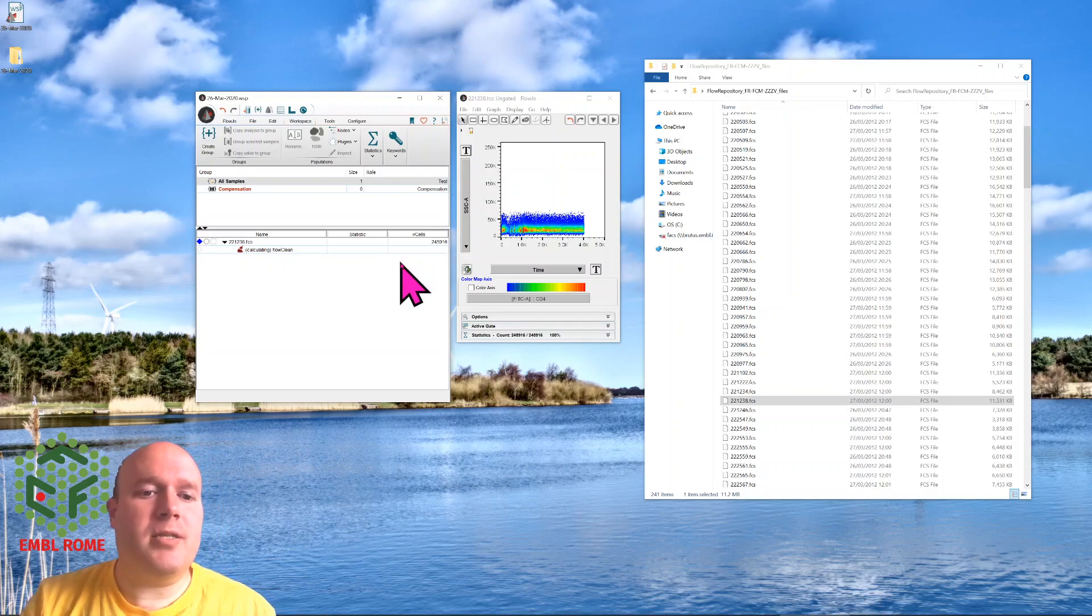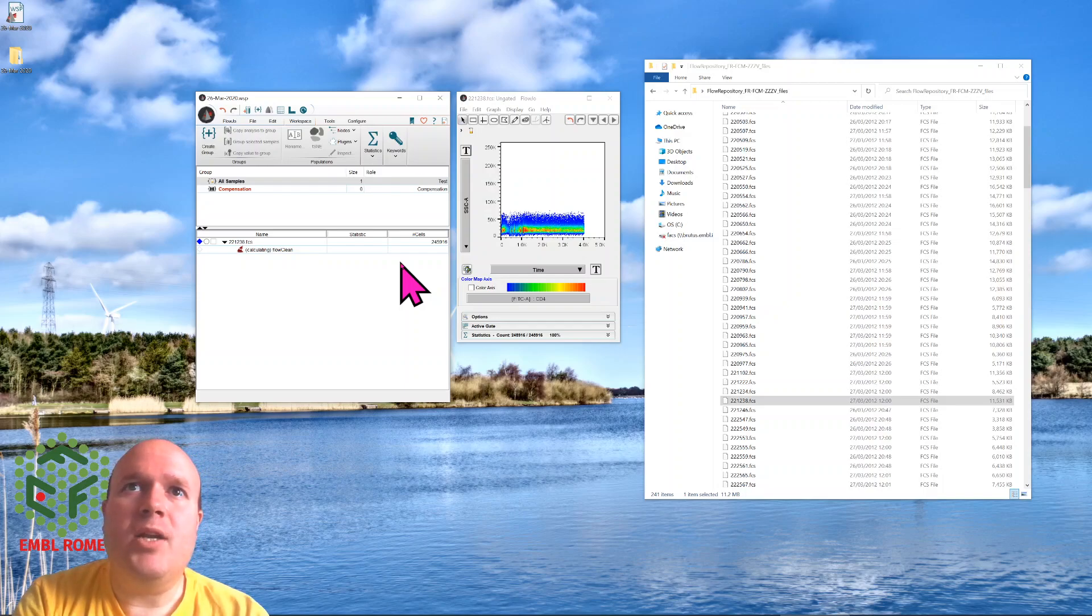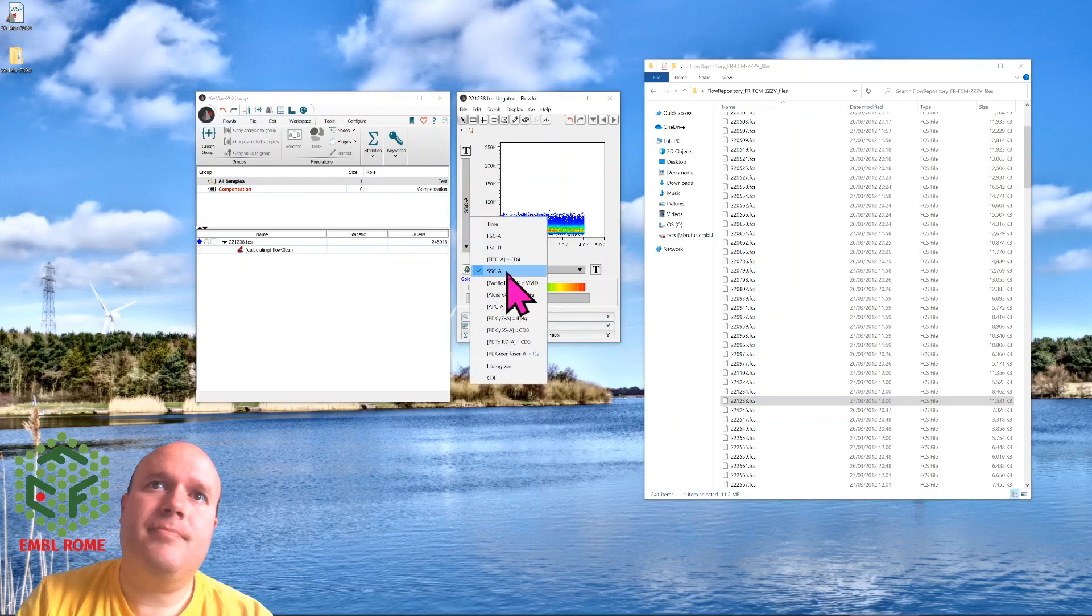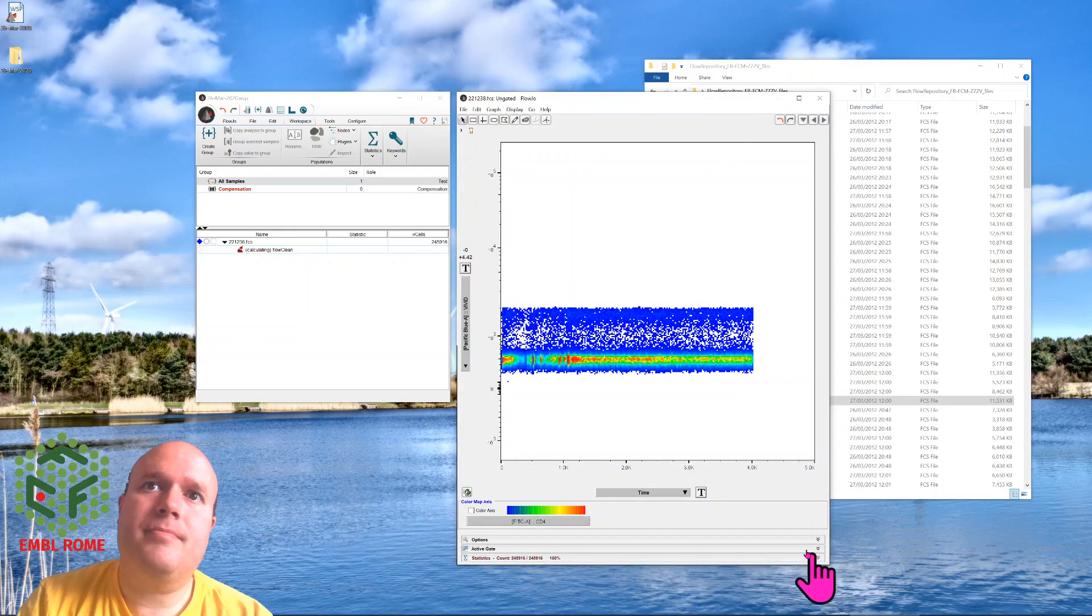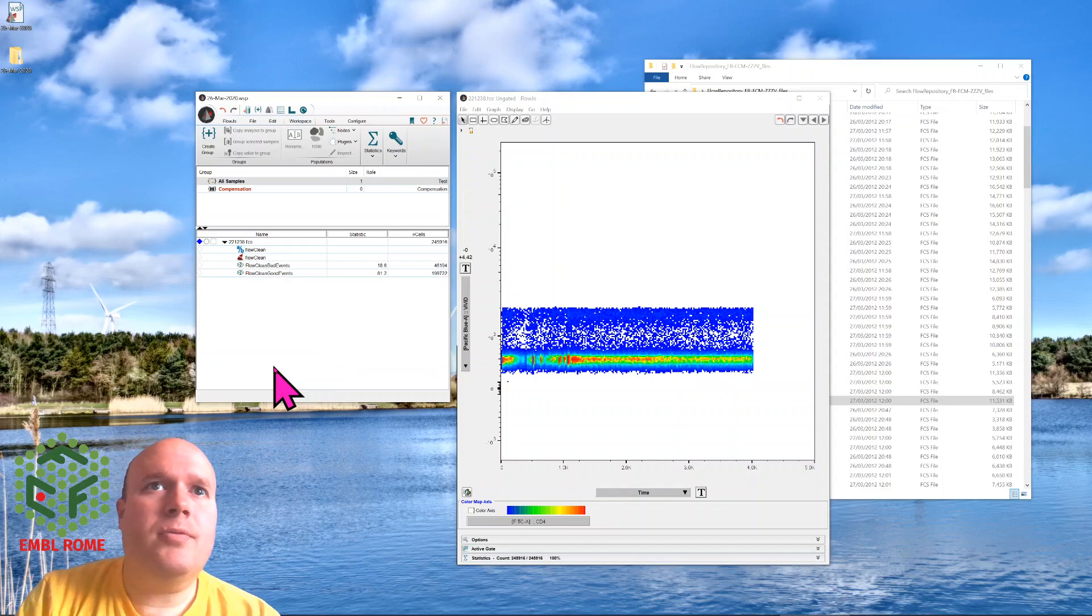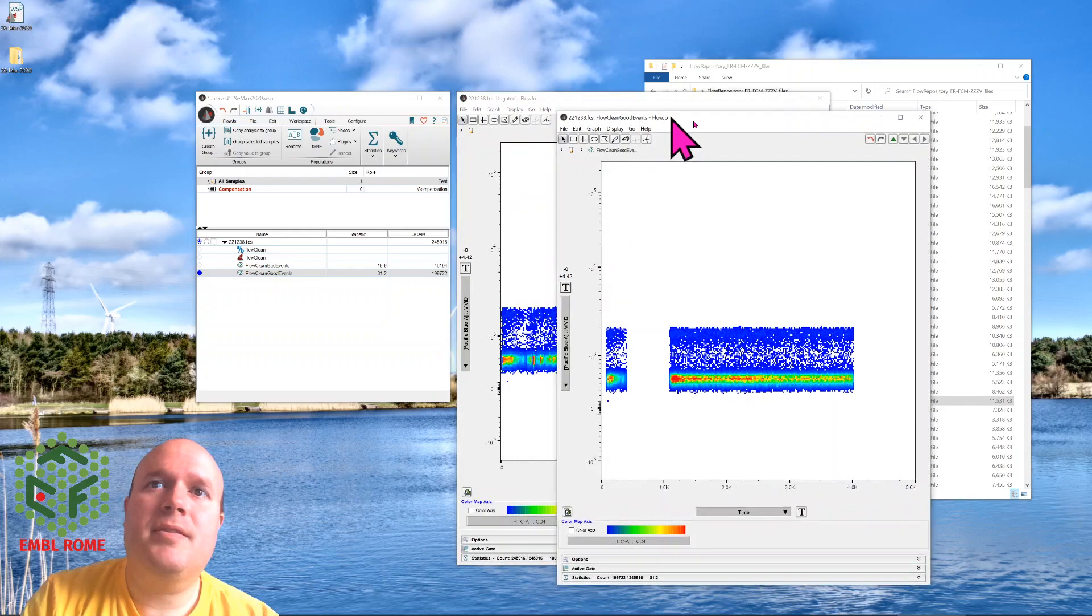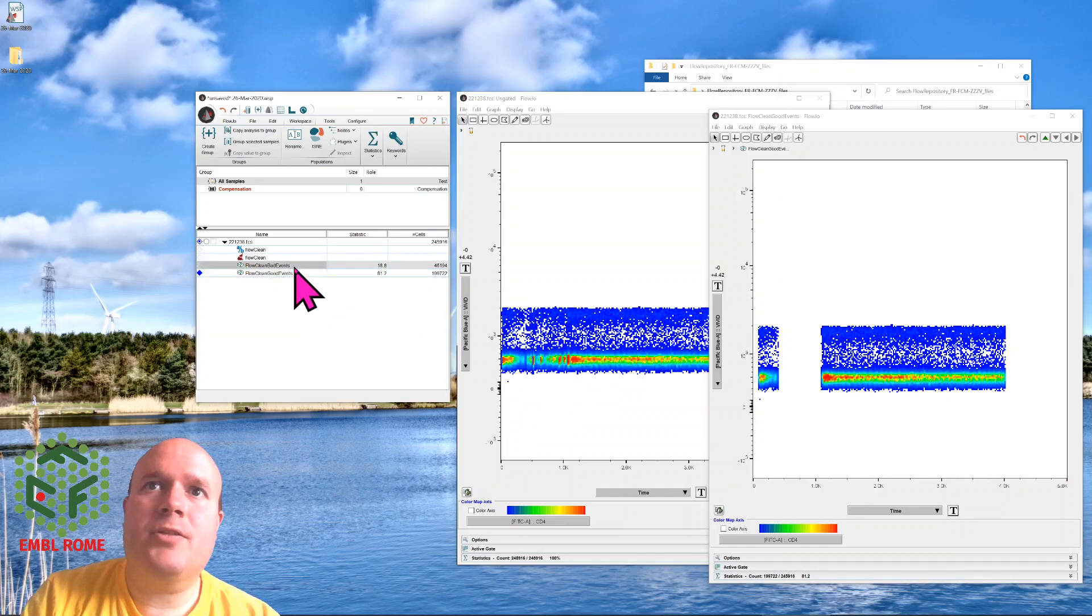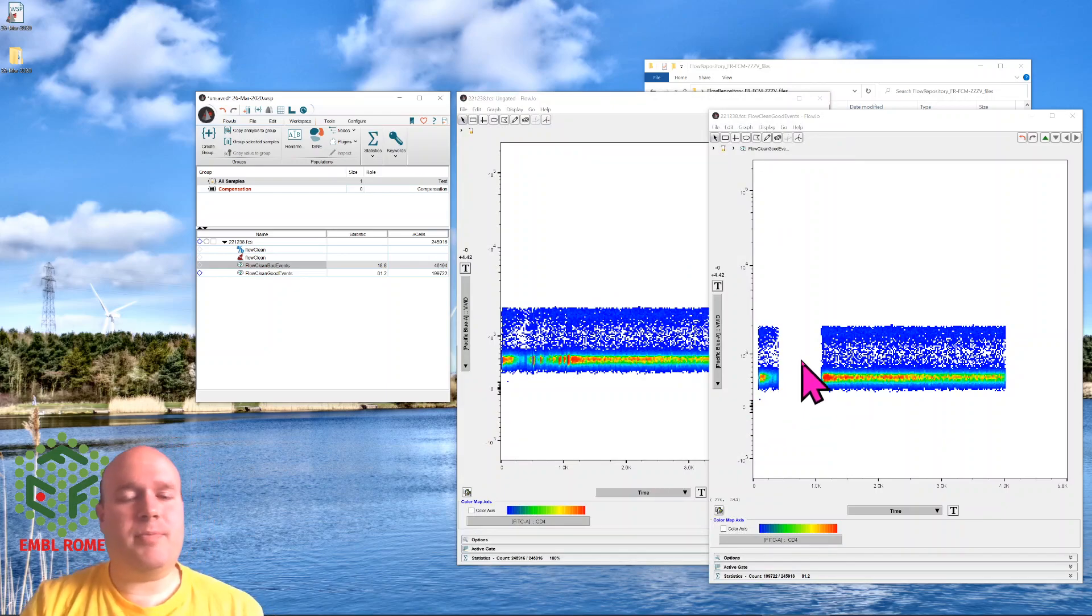Afterwards, we'll end up with two new gates, one called good events and one called bad events. Hopefully it will remove the start of this data here. Here we go, we've got good events and bad events. If I double-click good events, perfect. It's removed this beginning chunk. Bad events at the very start, and it's removed this middle bit. So it's automatically done this.